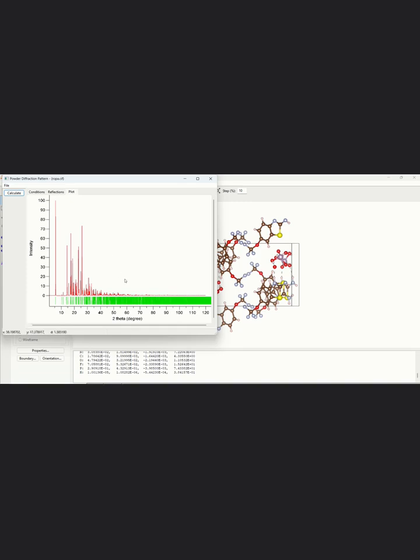this structure. So we can calculate the structure factor using these various peaks at various positions corresponding to the diffraction angle. So this tells about the structure, the electron density, and the crystal system.